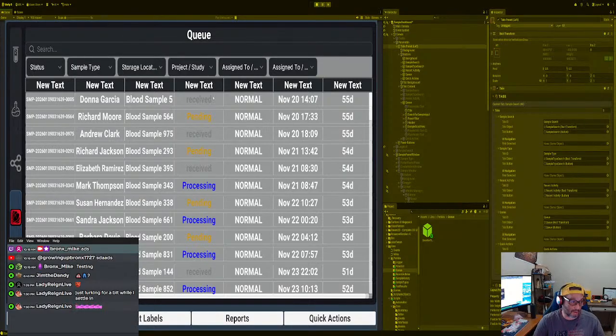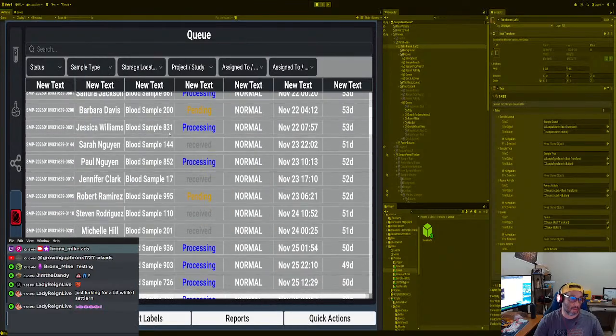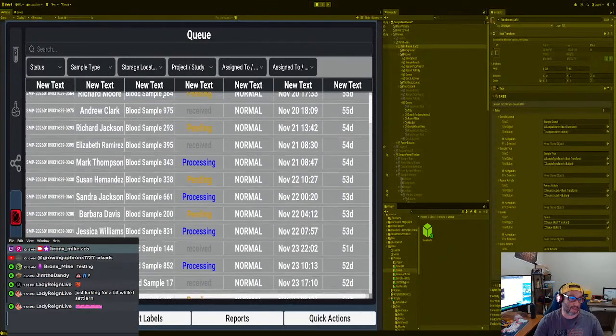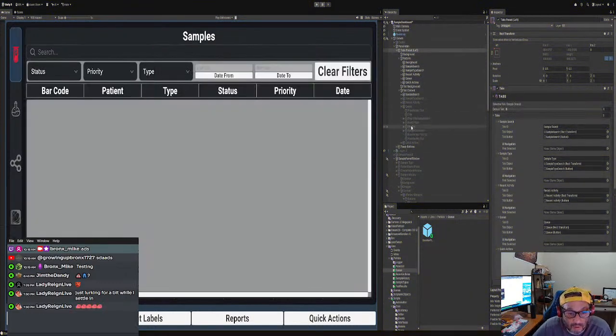This is what. So basically, oh, we gotta fix the headers, right? So basically, now, oh, cool. So now you go like this, you can see everything. All right. Okay. So let's fix the header designations, and then we're done with that.